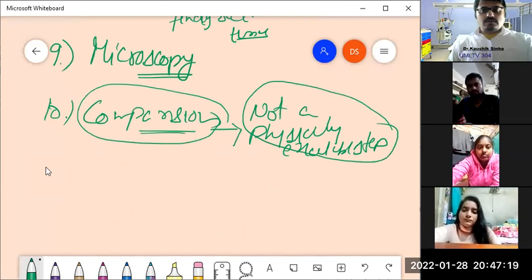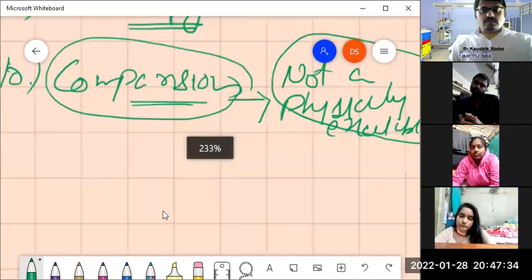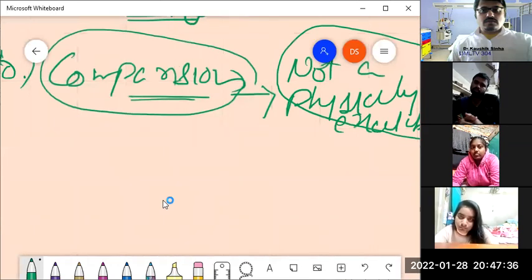Now, when that same histopathologist sees the collected and processed specimens under the microscope, at once the step of comparison occurs in the mind of the histopathologist.